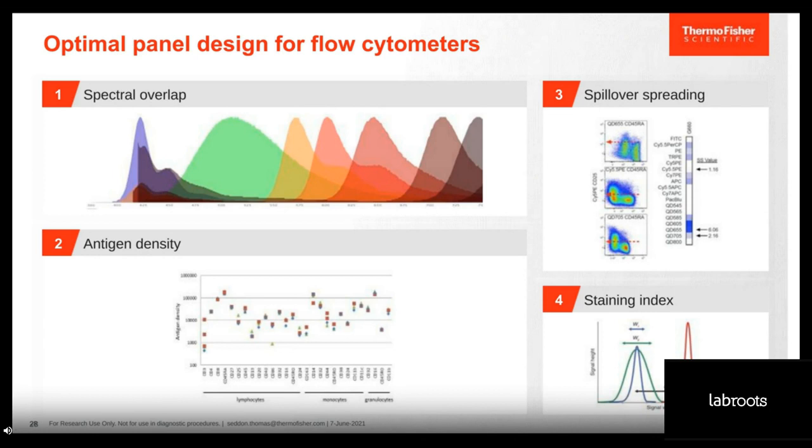And so now I've talked a lot about different dyes and what they do. What you can see here is a number of issues that you're contemplating, even if you're not thinking about how that is all working together. So there's the issue of spectral overlap. A lot of times we're dealing with that with compensation, and sometimes that is sufficient, and other times you can also have spillover spreading errors where you actually affect how much you can actually detect. So, have you lost the resolution, and so these dimmer markers can't be detected.